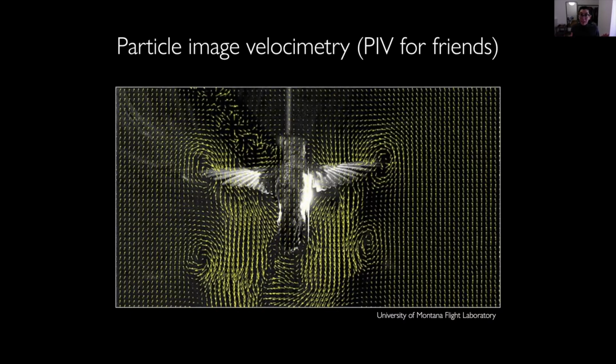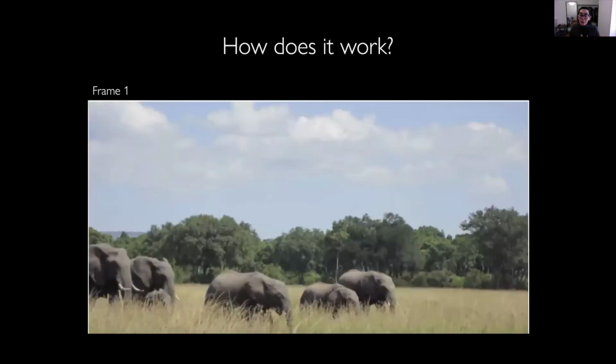Today it seems like a lot of animals are involved. So after the birds, and the squirrels and the unicorns we've seen before, I'm going to move on to some elephants to explain to you how the software works.